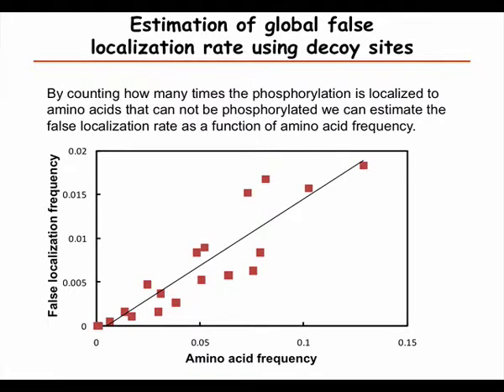Yeah. Sorry, I'm kind of confused. What causes false localizations? In the MS/MS spectra we have missing data and we have noise. That's what causes us to sometimes get it wrong. And by letting any one amino acid at a time, but all of them, even though they can't be phosphorylated, we say that in our matching, okay, now this time alanine can be phosphorylated.